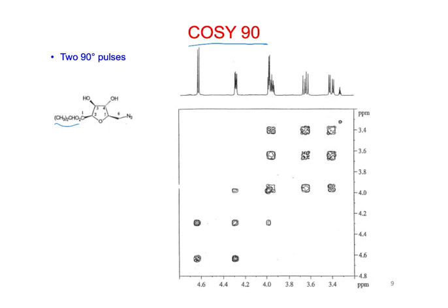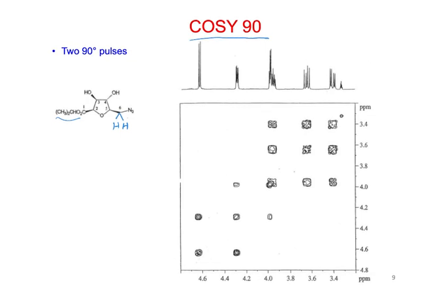Okay, so 6, out here, would be a CH2 group, right? And where do you think you would assign those in the spectrum? The only place with the doublet. So at 4.6. Yeah. Oops, I can't see that. It's blocked by my... 4.6? Yeah. So that one has this azide and a carbon on the other end. Do you think that's going to be the most downfield signal? It's the only one that I would.